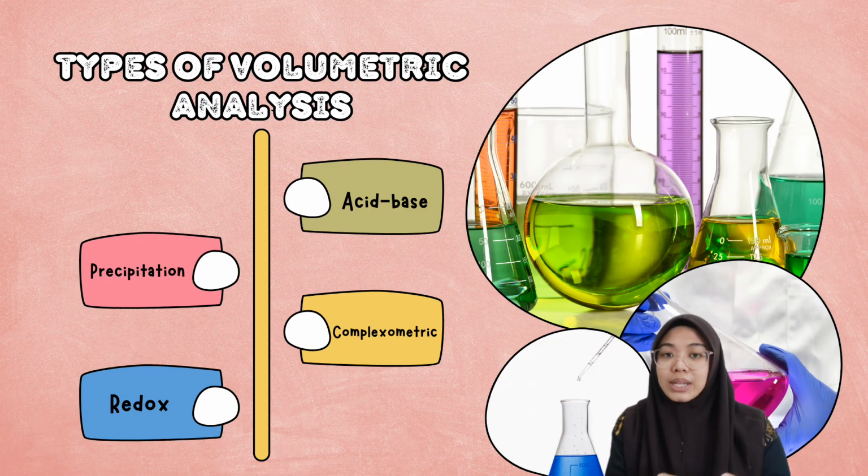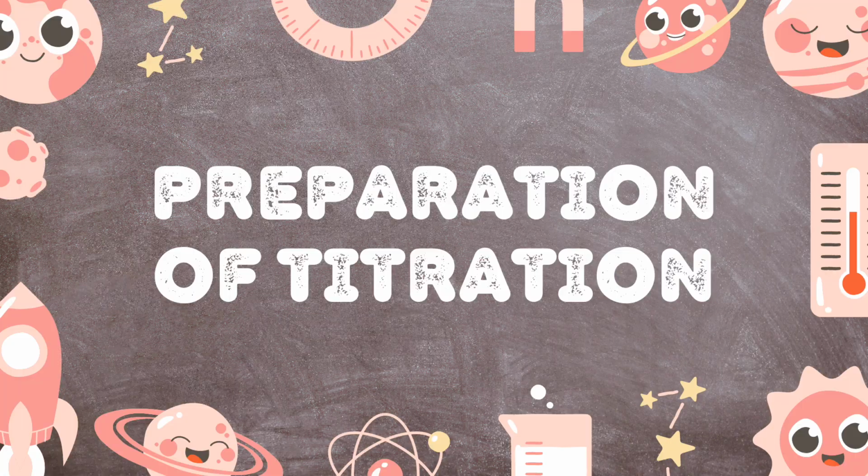In this video, we will go into detail on acid-base titration, but before that, let's recap how we set up the apparatus for titration. Let's go!